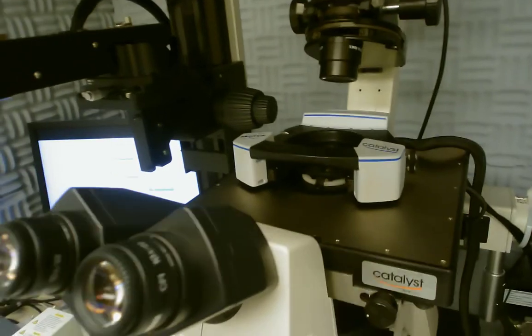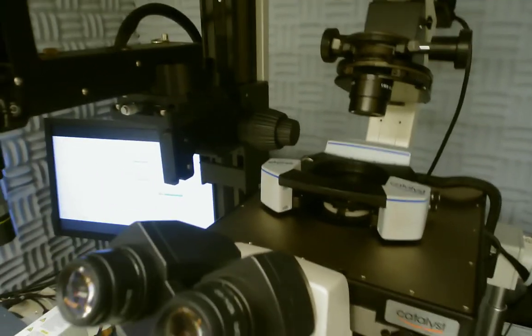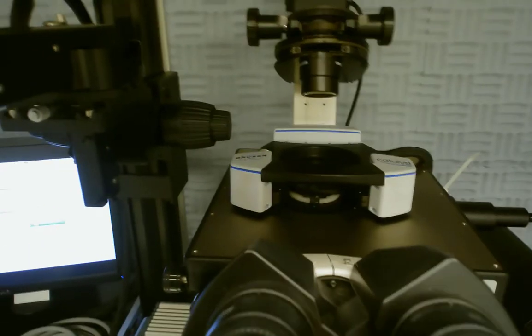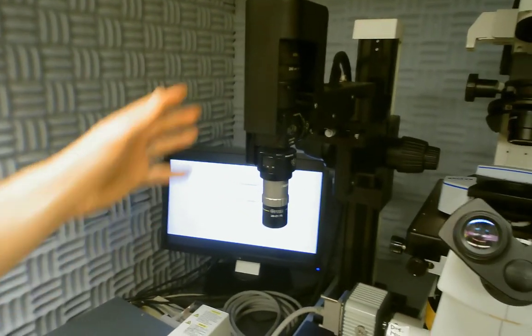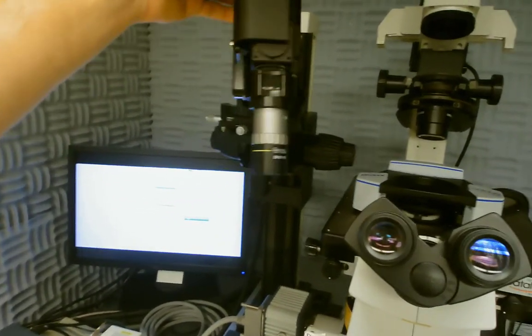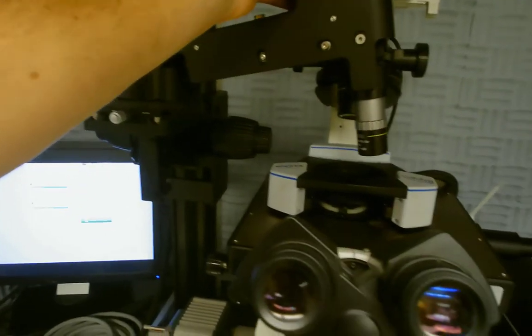There are two different cameras that you can use for imaging. One of them being the CCD for the fluorescence microscope. And the other being this camera here which is on a track that swings over and looks down upon the sample from the top.